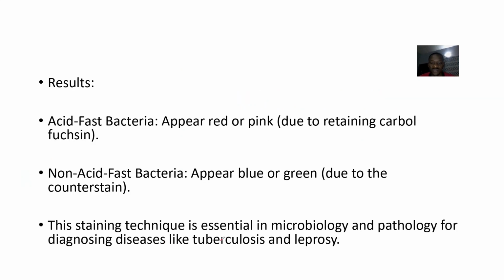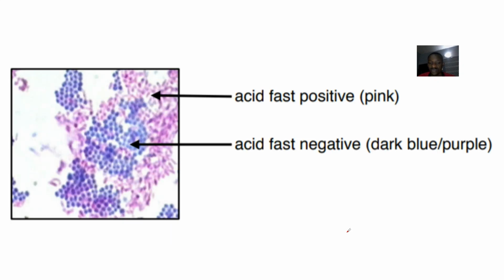Do you understand? So the staining technique is essential in microbiology and pathology for diagnosing diseases like tuberculosis and leprosy. All right.